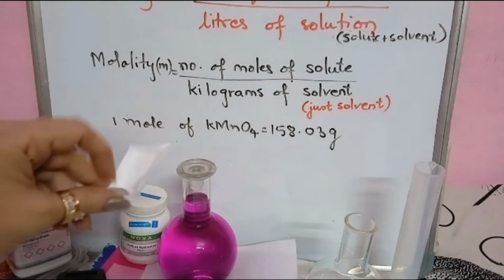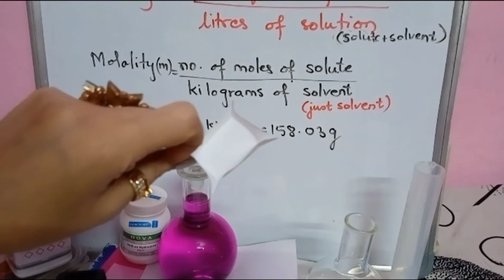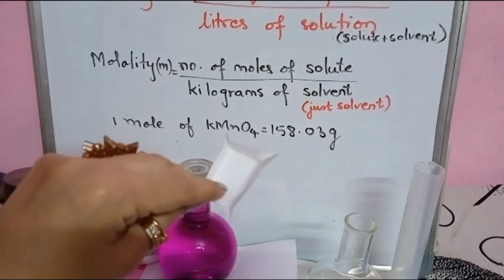Now yet again I'll go to the scale and measure the same amount of potassium permanganate.